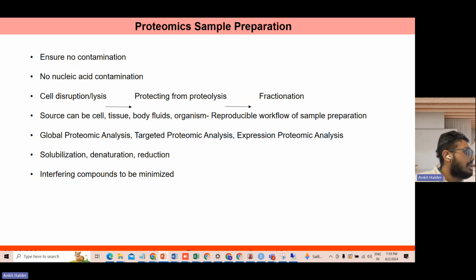For both, and specifically for the gel-based methods, if there are certain contaminations like nucleic acids, lipids, or those proteins, then the gel will come with a smear. There will be different kinds of streaking. Obviously we won't be going into the details, but in next week's live session, I will show you the different kinds of gels, where you need to identify what can be the cause of that streaking, like vertical streaking and horizontal streaking.